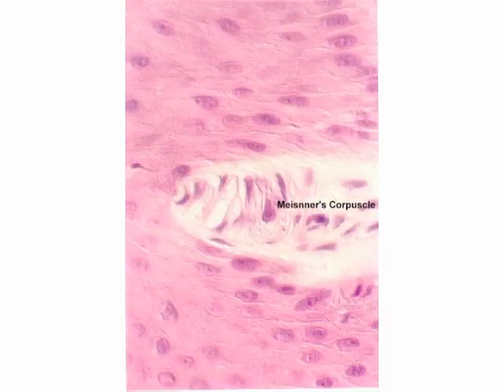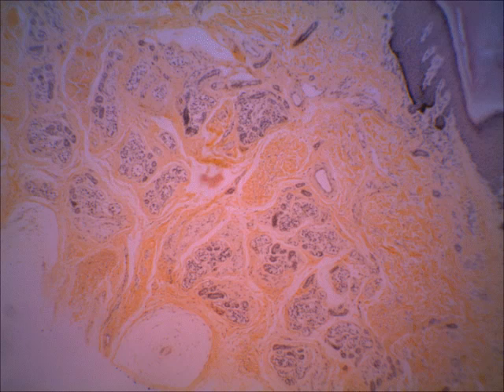Let's look at this next slide. And there it is a little bit more magnified. You can see what I mean again by swirly. Looks swirly. Okay, now if we move to the next slide, this is still a skin slide.